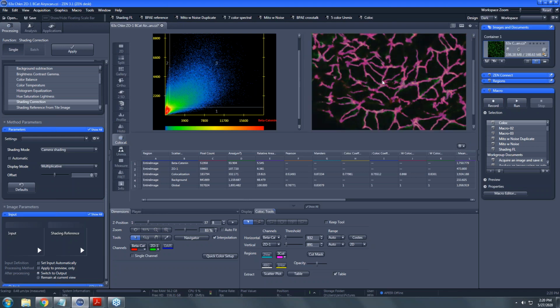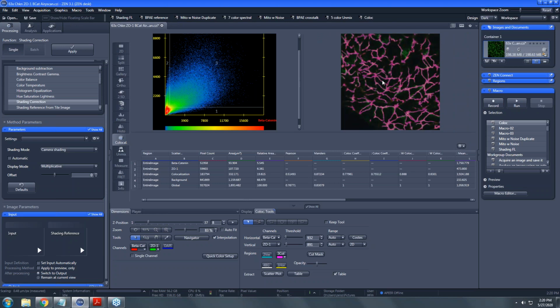So the pixels that we're evaluating and performing the colocalization statistics on are changing as we change that threshold. And I guess the take-home point that you should definitely get from this, other than you can quantify your colocalization, is that these coefficients are somewhat meaningless when they're taken on their own.